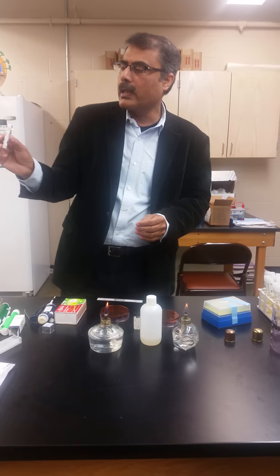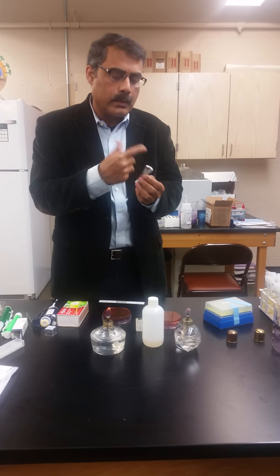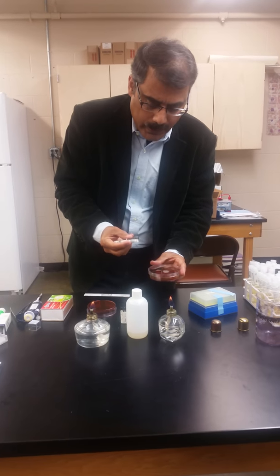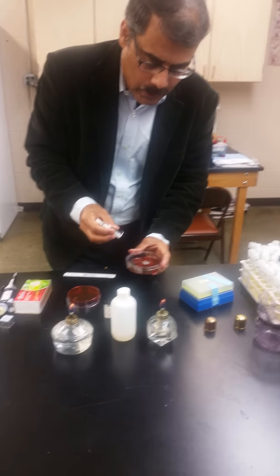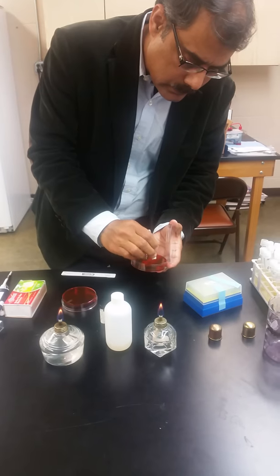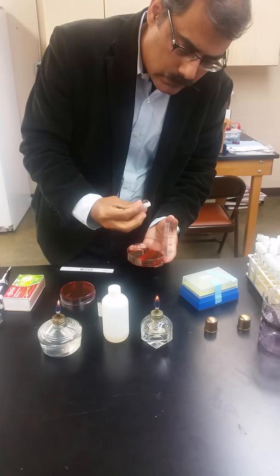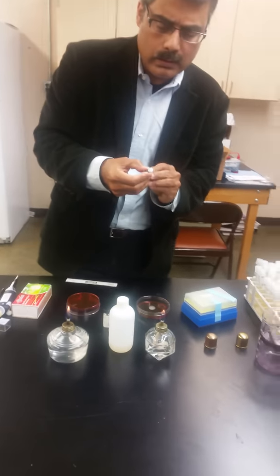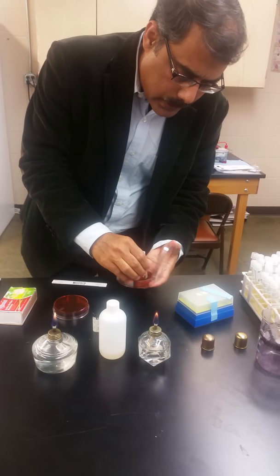So this goes on like that, and there is a little lever here that I'm going to press, and then the disc will come out. So all you do is open your plate and ensure that you are horizontal to the surface, and just press it. If I can get it out. So close. Not all the way up. There you go. So you take it out.